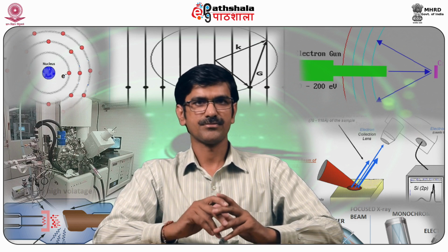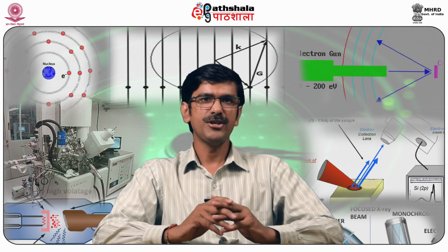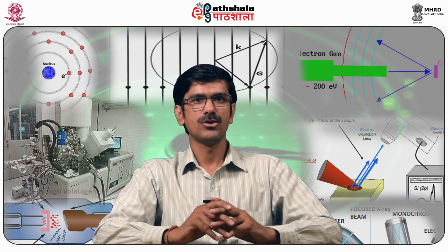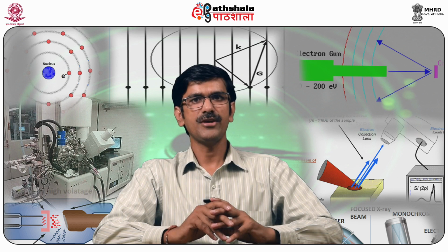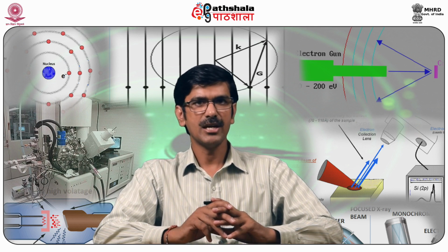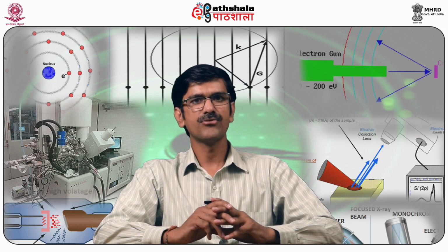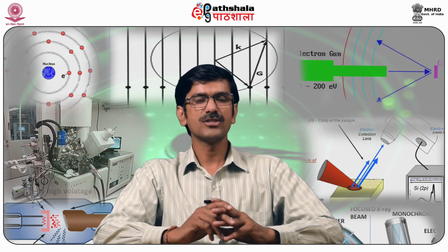Samples can be investigated either in bulk or in microscopic amounts over a wide temperature range and physical forms, that is liquids, gases, powders, latex, monolayers to multilayer films, fibers, or as surface or embedded layers.